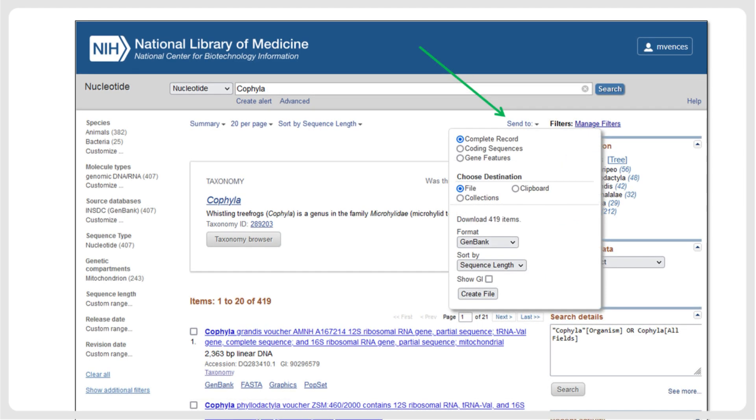For downloading, we select Send To, then we choose File, and as Format, we choose GenBank. This will download a file called sequence.gb, which contains the sequences and all the associated metadata.